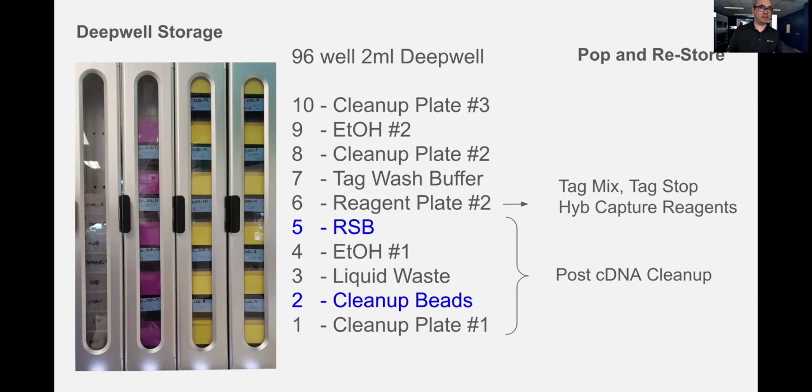The stacker is able to both dispense a labware and also store a labware. So what I did here was that you see the bottom 5.